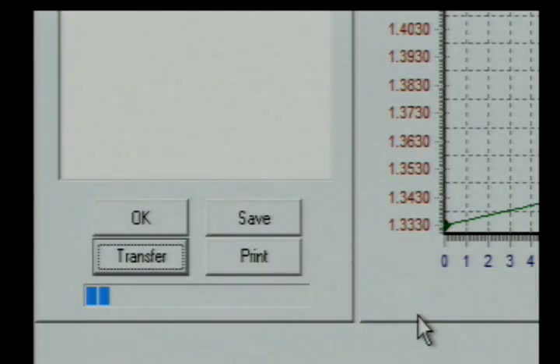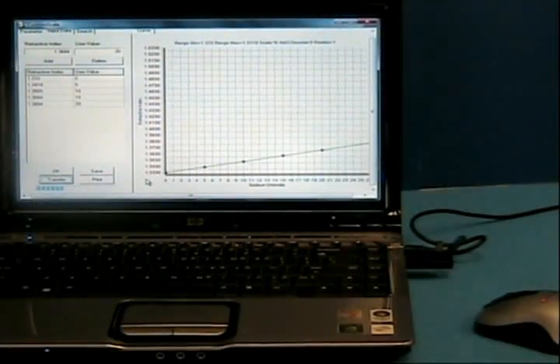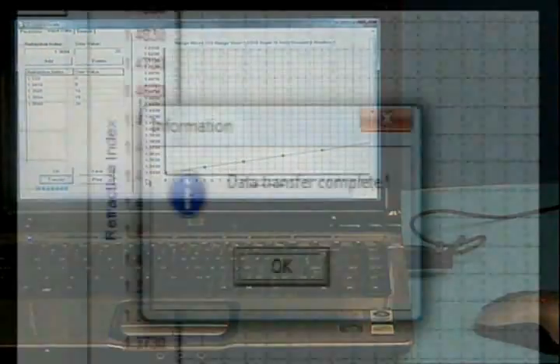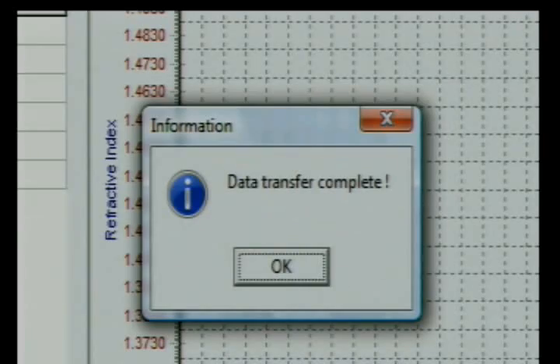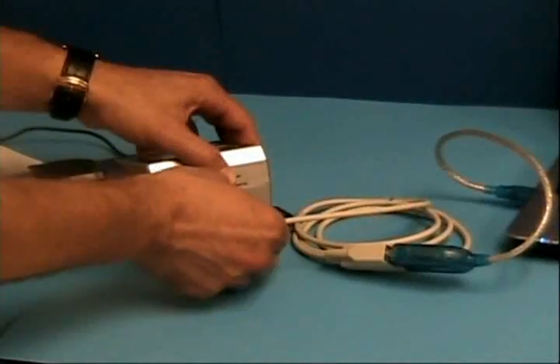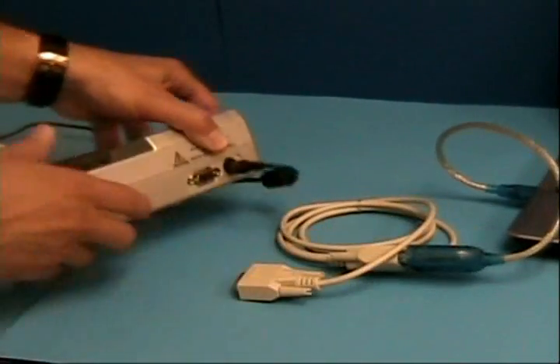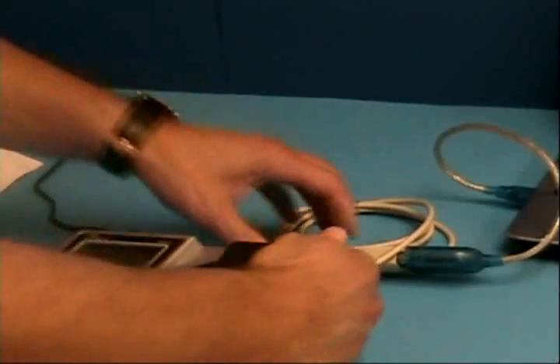When finished, transfer the results to the refractometer. Once a scale is loaded on the refractometer, you can conduct measurements independent of the computer.